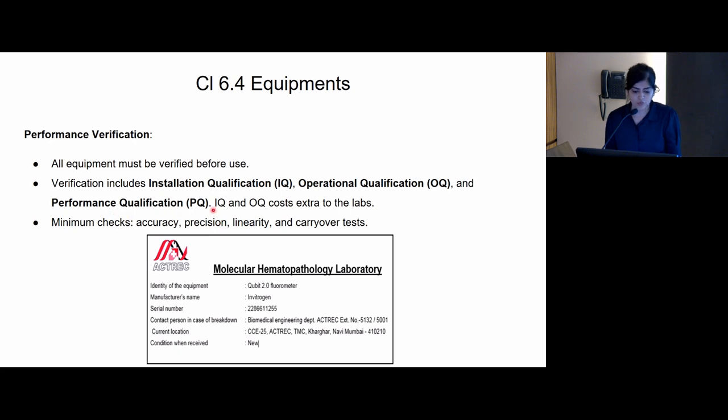And the PQ is done by the labs themselves, periodically, and everything is properly documented. This is how we put the label on different equipments, recording all the important information that has to be maintained properly on the instruments.